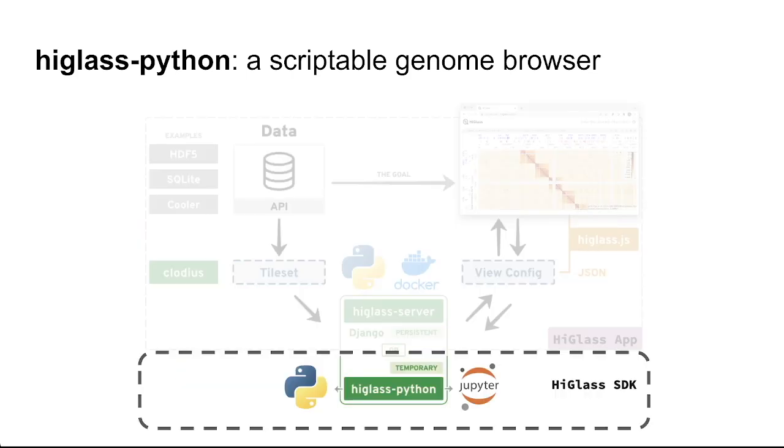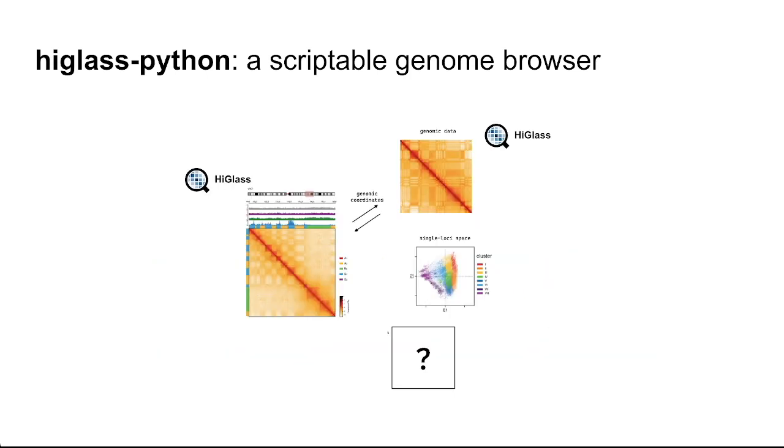So beyond this core Higlass application, higlass-python really is the software developer kit that exposes these backend functionalities to both Python developers as well as data scientists to be able to explore and visualize 1 and 2D genomics data. A traditional Higlass visualization allows coordination between other genome browsers or other Higlass views. However, with the tight integration into Python, users can extend Higlass to link the genome browser with other representations of the genome. The tight integration with Python and Jupyter allows for bidirectional linking of a genome browser within external notebook components and other stateful widgets, such as scatterplots, charts, or drop-down menus.